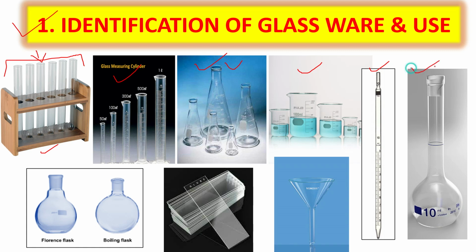Next is volumetric flask. Many other types of flasks are there, that is Florence flask, boiling flask, separating flask, many other flasks are there. And next is slide. So slide is used for staining purpose and to see the microorganisms under microscope. And next is glass funnel. Okay, so we have to mention all the uses of these glasswares in lab purpose.